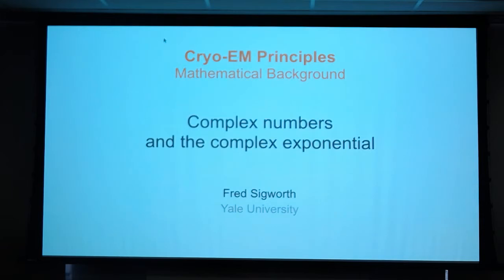Great, thanks so much. So I'm going to attempt the impossible today, which is to start from total basics and end with maximum likelihood reconstruction and classification. I thought I would start really at the very beginning with complex numbers, and then use these complex numbers to talk about wave functions, and then talk about interference of waves in the microscope giving you the focus contrast, and that motivates a little bit about Fourier transforms.